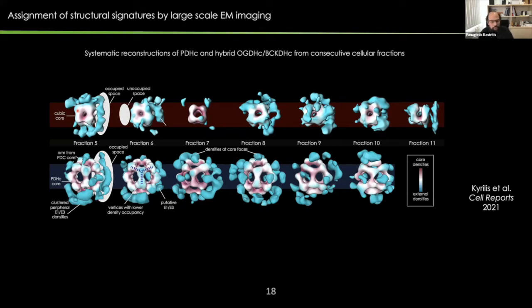And what you can appreciate from the color coding is that these structures have not been reported before in their totality. With X-ray crystallography, we have determined, for example, the overexpressed cores or, at high resolution, the subunits around them.